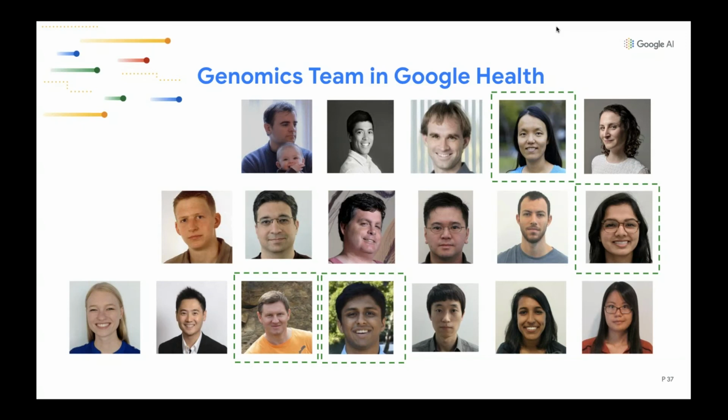Yeah, this is a good question. Let's break down the two different components to this. One of which is, can we train DeepVariant to call variants in RNA-seq data in some form? This is a project that's been of quite a good deal of interest. It's been on our radar to conduct. We think it's relatively easy to do with respect to the generation of the data that would allow us to train. So yes, we want to do that. It will be possible to do that for either PacBio data or for Illumina data. We just need those data types. I think this will be done. I think the question of timing has to do with when there's a good data set that will enable us to do that. So far we've been hoping that partners will come to us with that.